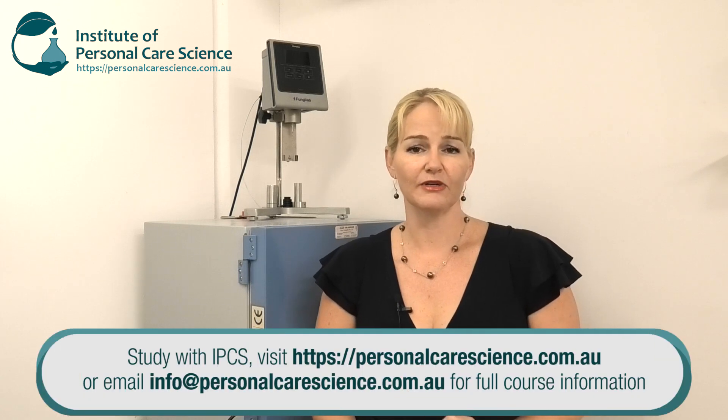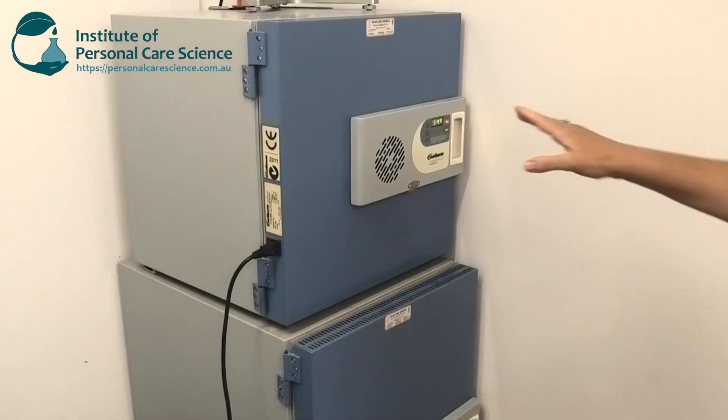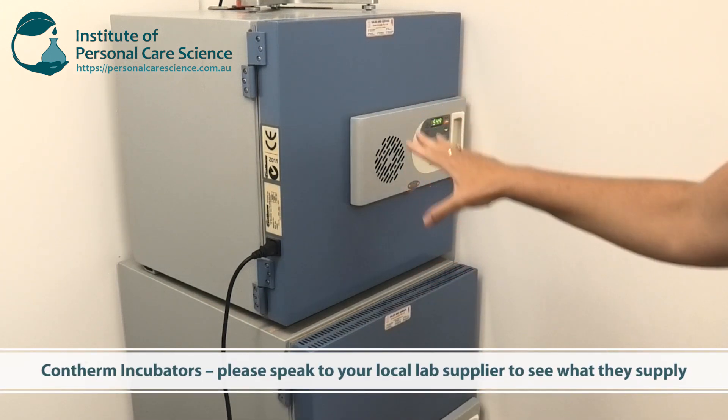You can use incubators to test stability of your products very effectively. At the end of the day, if you get yourself some good incubators you're going to have them for years and you're going to be able to conduct your own stability testing, saving a lot in the long run. They're not a huge investment. Let me show you the incubators I have here — they're both Contherm incubators.